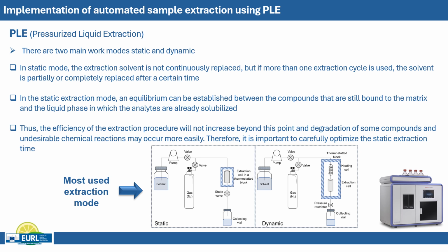There are two main work modes, static and dynamic. In static mode, the extraction solvent is not continuously replaced, but if more than one extraction cycle is used, the solvent is partially or completely replaced after a certain time. In the static extraction mode, an equilibrium can be established between the compounds that are still bound to the matrix and the liquid phase in which the analytes are already solubilized.